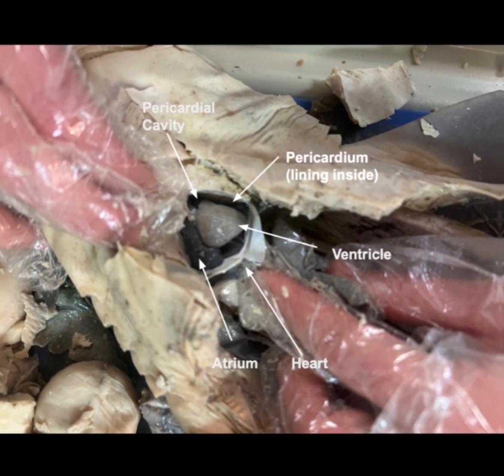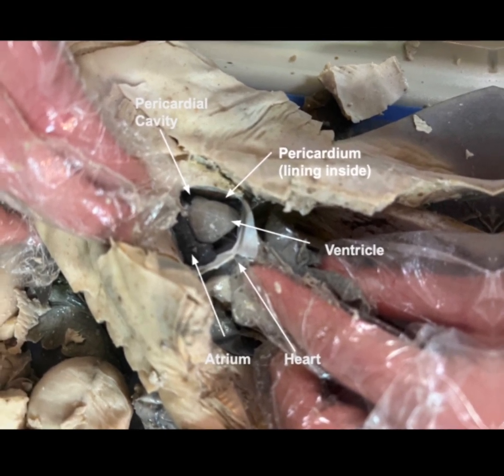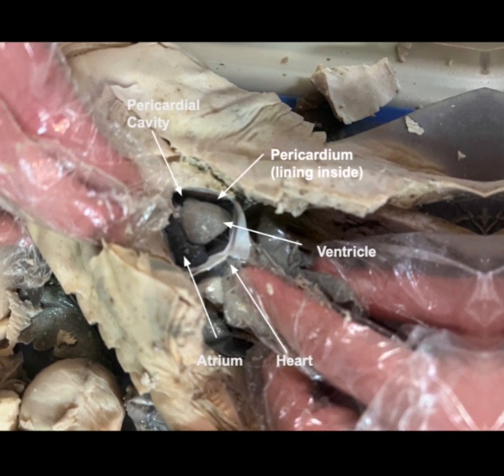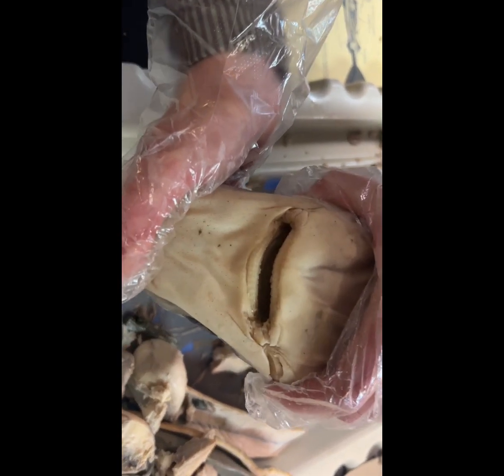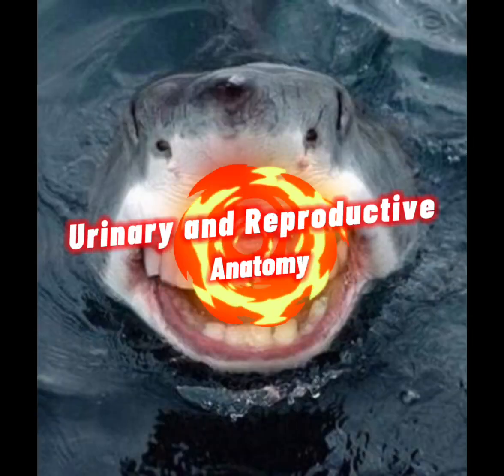The heart is located in the pericardial cavity, which is the upper portion of the body cavity. The heart has a 2-lobed atrium and a muscular ventricle. The atrium collects the blood and pumps it into the ventricle. The ventricle pumps the blood to the gills and then to the rest of the body. This is the mouth, and inside of it is the tongue, which is basically immovable and has no muscles.